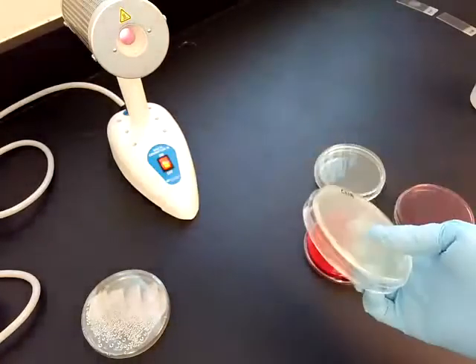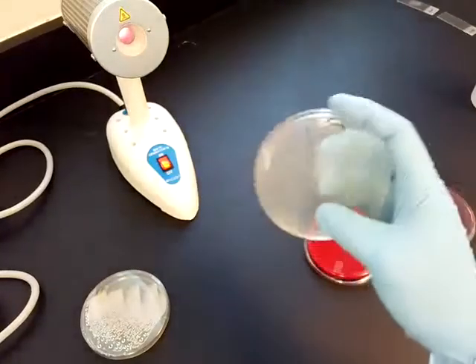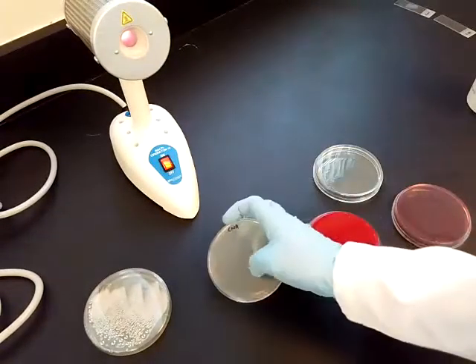So these are the 4 types of media, and I'm going to show you some results of this media and how microorganisms grow in the media in just a little bit.